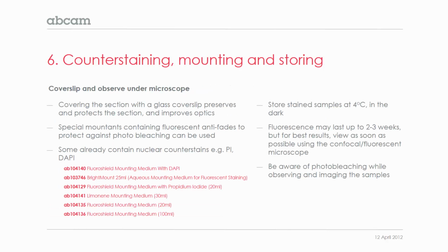So once you've finished your staining, you'll then want to mount the slides. Covering the cells with the glass on the slide will help preserve the sample, keep the cells safe, and it protects, and it also improves the optics when you're looking at it through the microscope. If you are using immunofluorescence, there are some special mountants containing fluorescent antifades available, and these help protect against photobleaching for when you're storing the slides as well as for when you're viewing them.